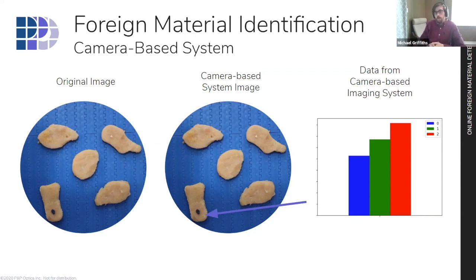It should be noted though that one advantage of these systems is that they do tend to be very high resolution. Just like with consumer cameras, for a very low cost, you can get a very high quality, high resolution image.